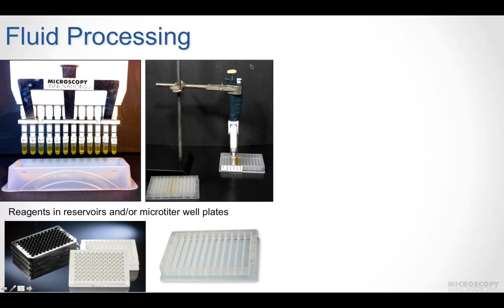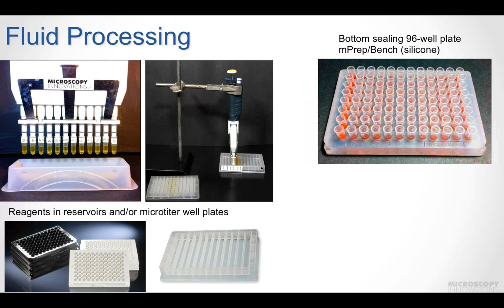And at any time, one can press the button here on the top to cause some mixing of the fluid to create agitation. And so one may begin the process in one row, pipette up the fixative, pipette up a rinse, pipette up the secondary fixative, etc., all the way through. And it makes it very easy to track the process, and takes very, very little time. And at some point, one may want to take the capsules and transfer them into an oven or some other device when they're fluid filled.